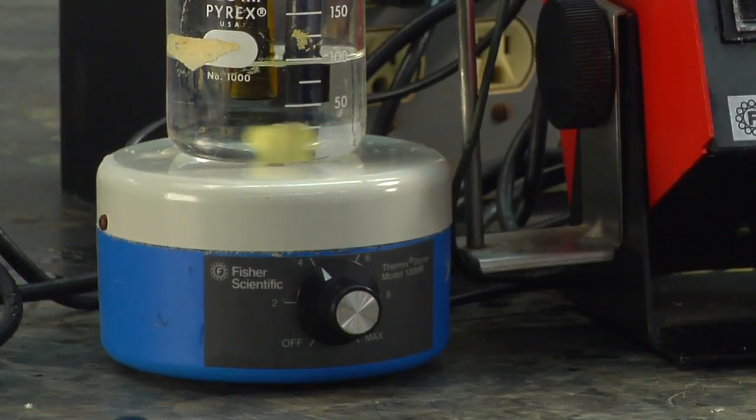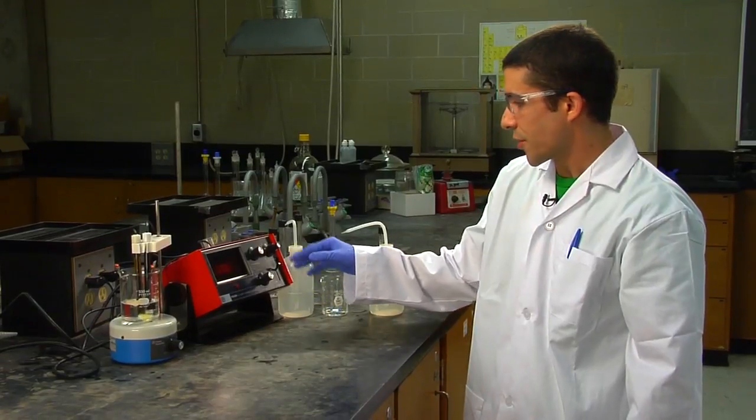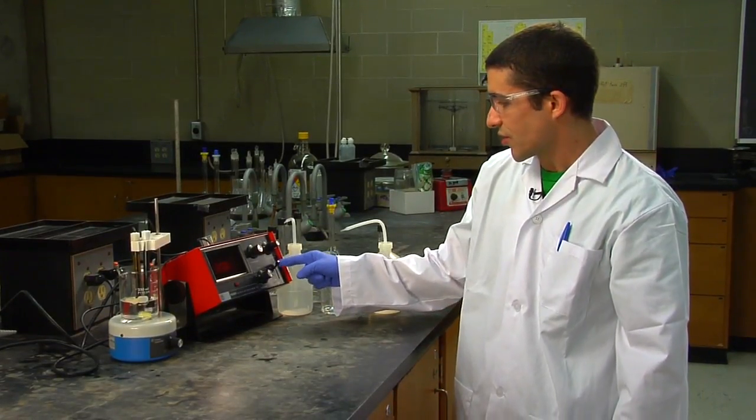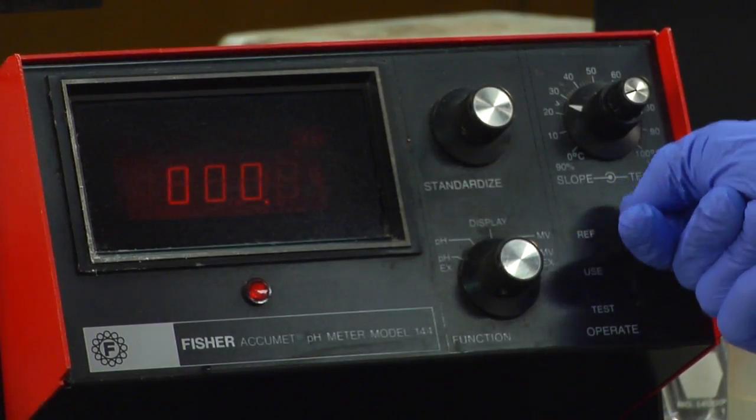You can turn on the magnetic stirrer to allow mixing to occur, and when you're ready to take a measurement, you can just turn this switch that is, right now it's on reference or standby, just flip it to use.